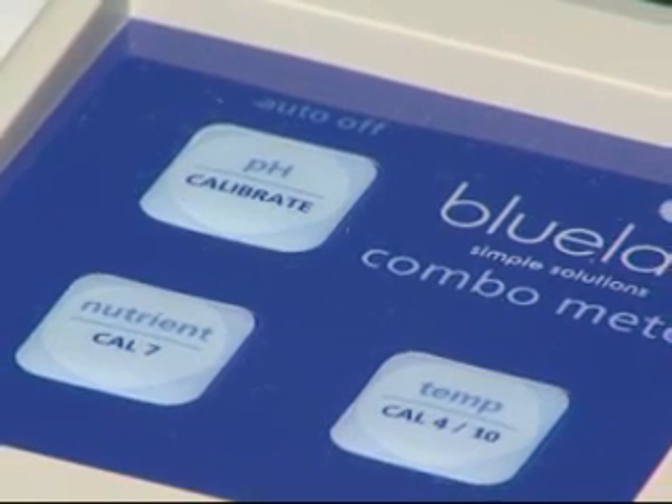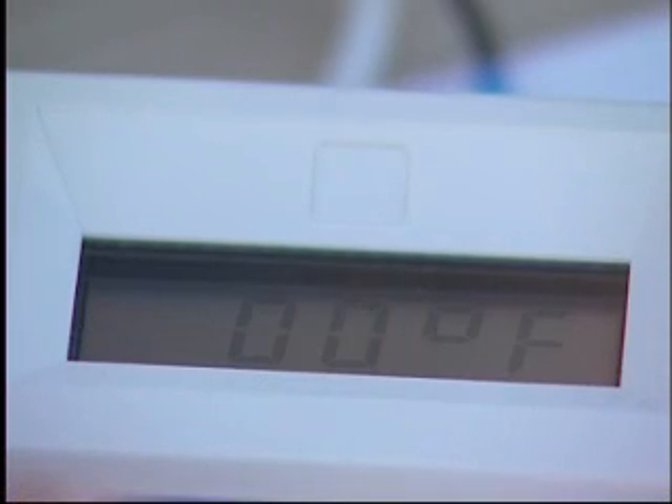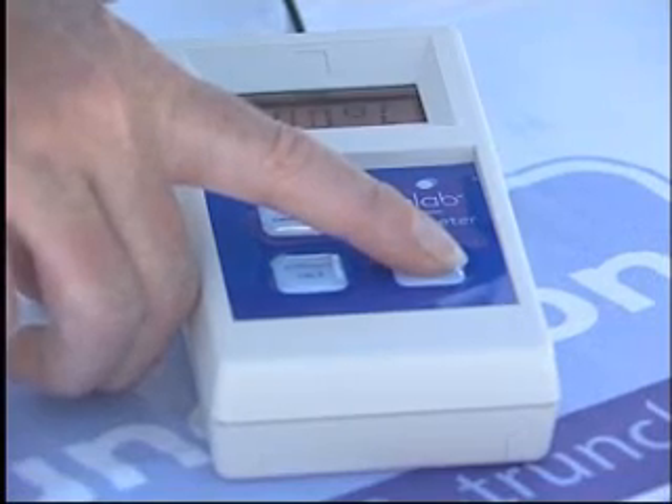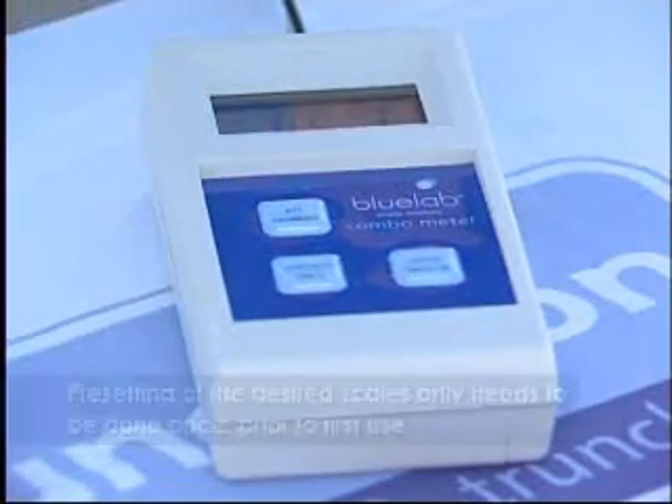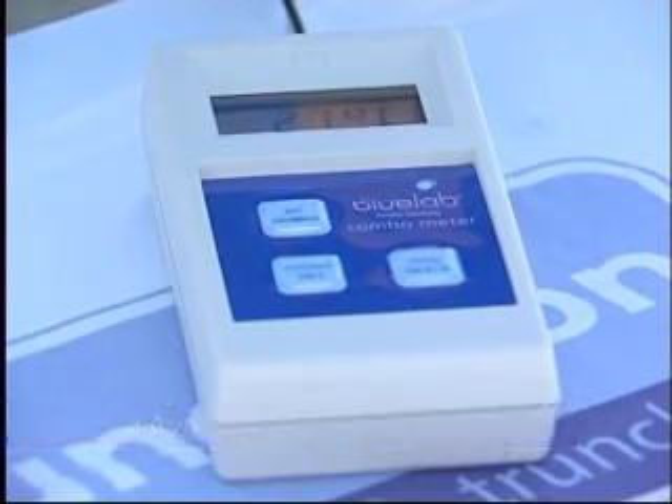To select the temperature scale you wish to use, hold down the temperature button until the on-screen display flashes, then release. While the on-screen display is flashing, short-press the temperature button repeatedly to skip through the available scales. When you have the required scale, leave until the on-screen display stops flashing. Your new temperature scale is now active.